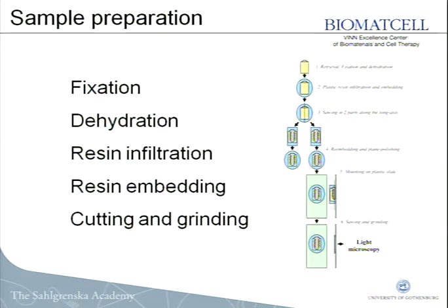Then you cut it in half and polish, and you can put it on a slide and saw out a thin section for light microscopic evaluation for histology and histomorphometry. For those interested to see how these amputation prostheses look, there is a poster, 26318, where we have looked at 7 different implants retrieved from patients. I will not go into that now.